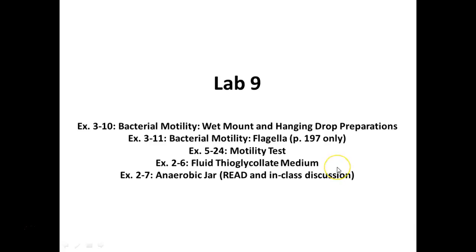And then fluid thioglycolate we just looked at. Again, the question we're asking is, can your organism grow anaerobically? And then the anaerobic jar, which is this. We don't do this activity anymore because, believe it or not, one of these jars is a couple hundred dollars, and we don't have enough for all the classes that work. Some of the seals don't stay sealed anymore for these jars. With them continuing to cut our funding, I don't ever see us getting any more of these jars. But the FTM can give us that answer anyways.